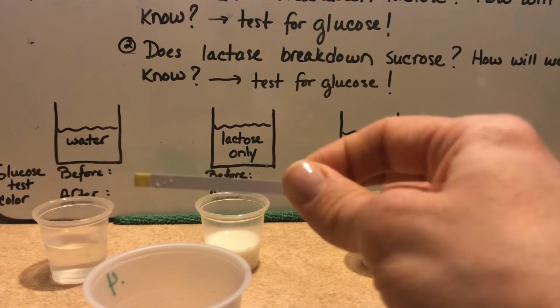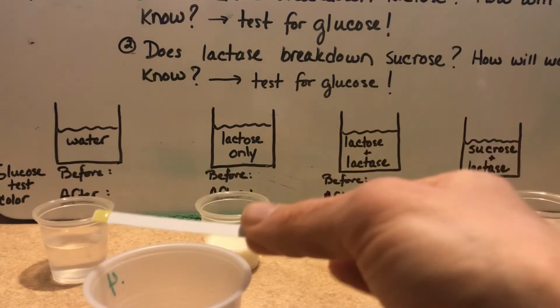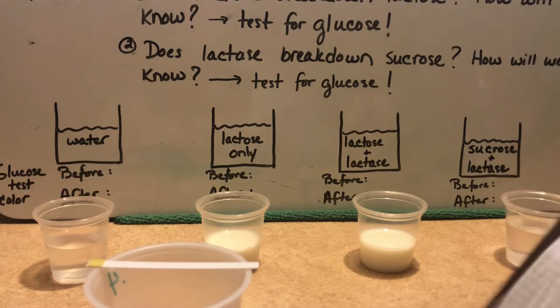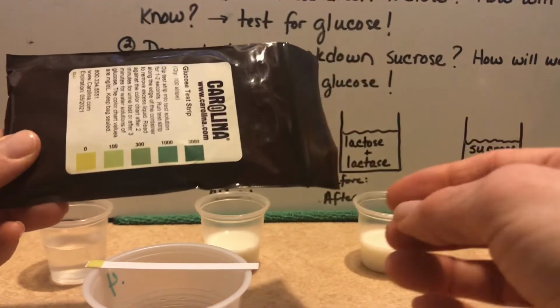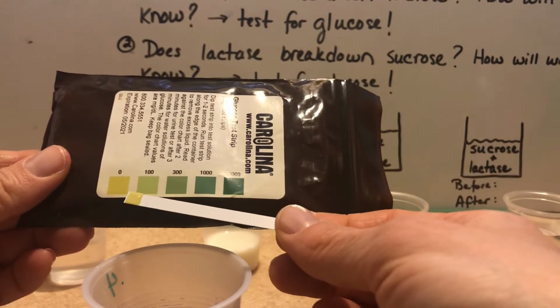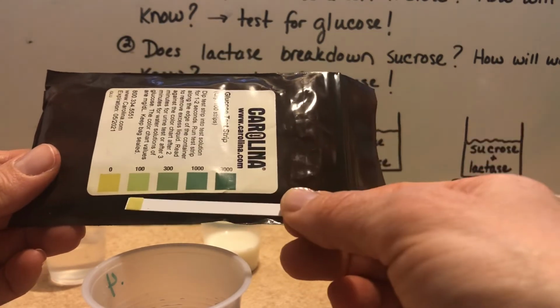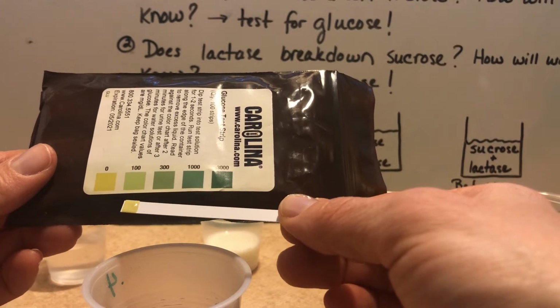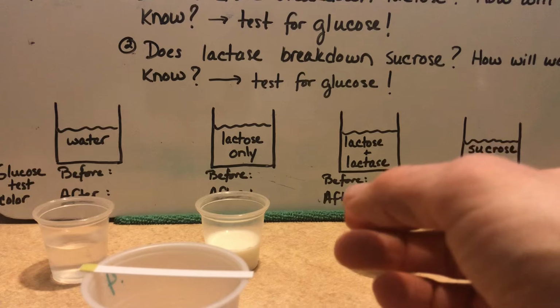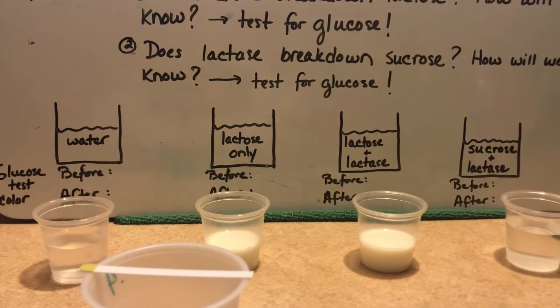And it's already starting to happen gradually. I'm going to let that sit there and change a little bit more. It's changing a little slowly.